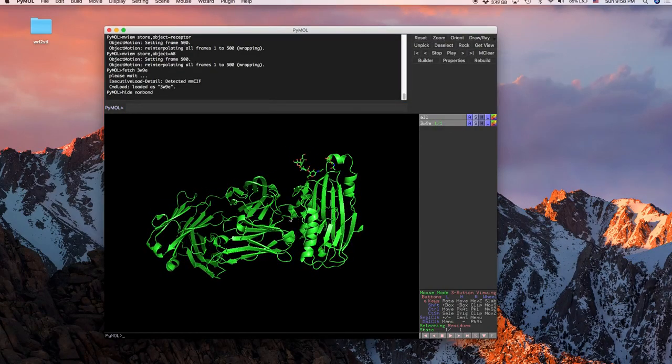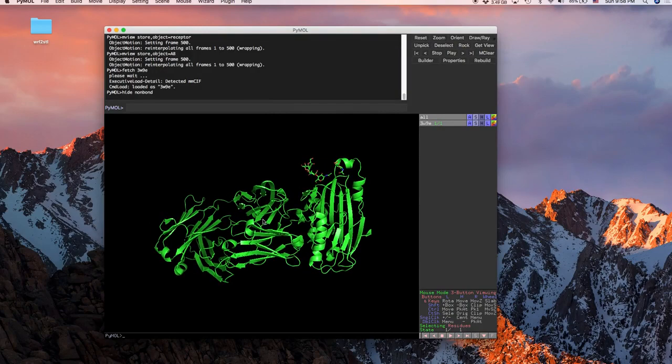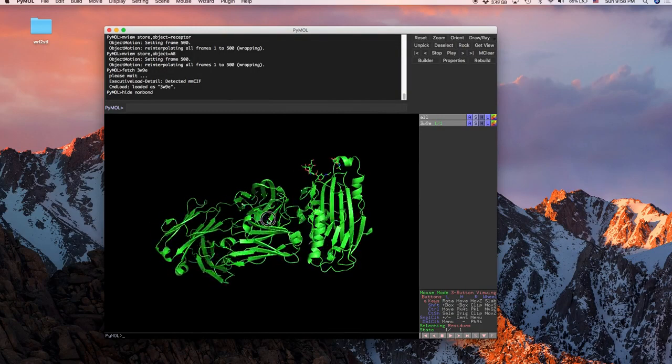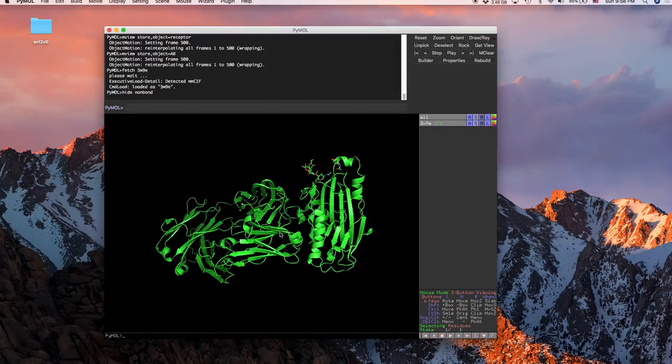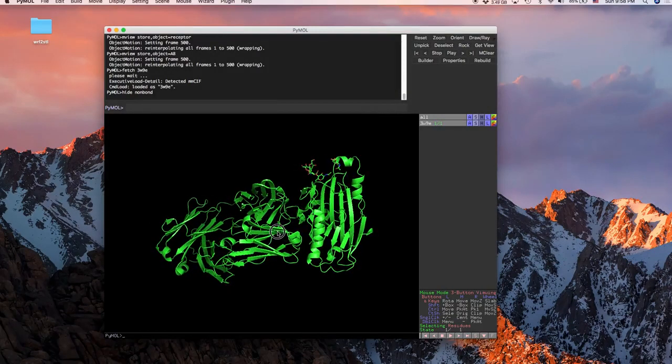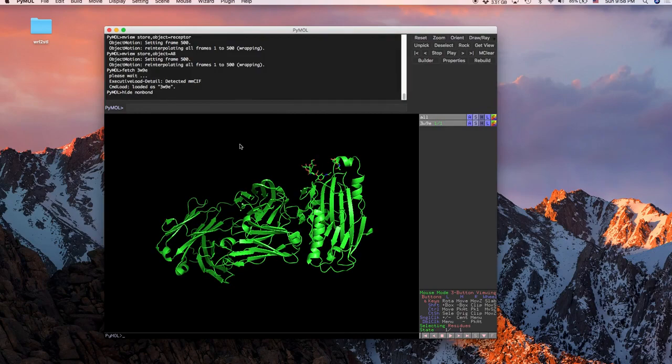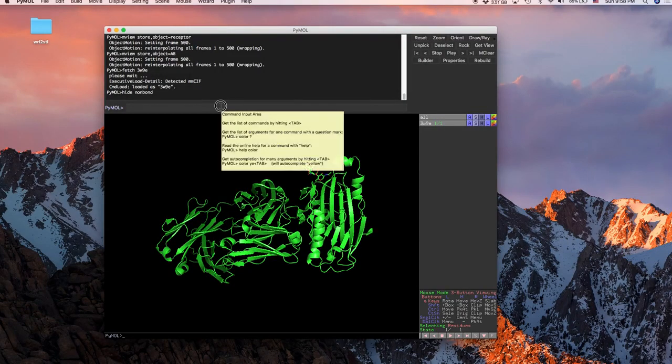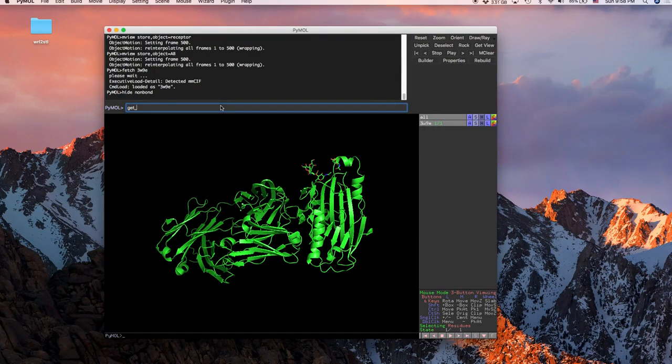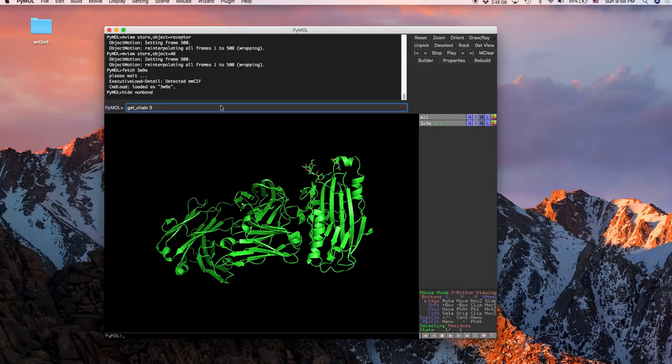First thing you want to do is we're going to have to make the two molecules that you're going to want to be interacting into two separate entities. So to do this we're going to type in get underscore chain and then type in whatever you just put in your workspace.